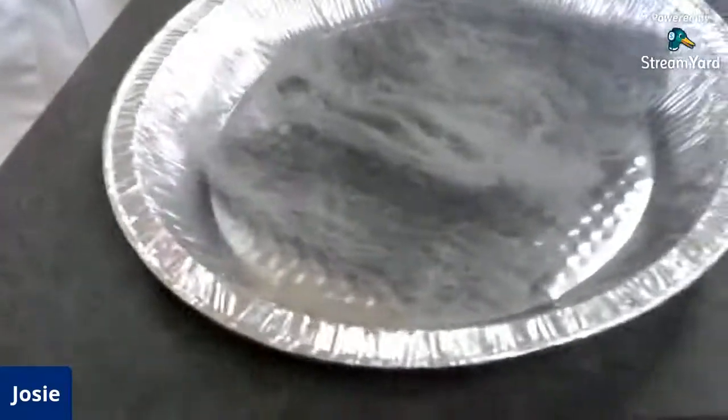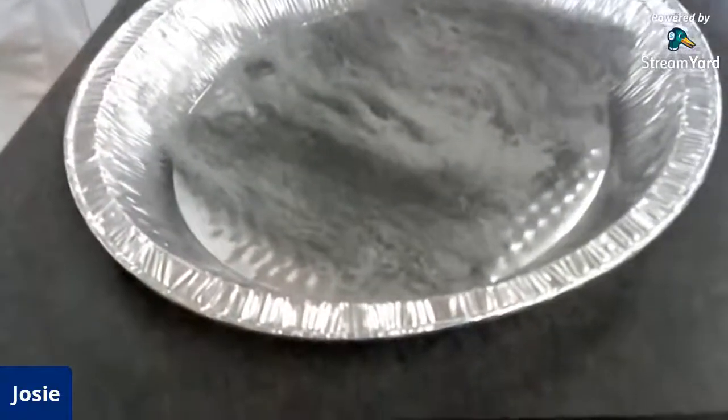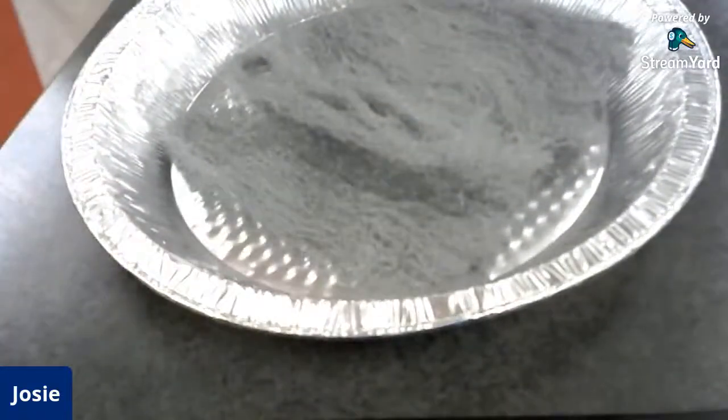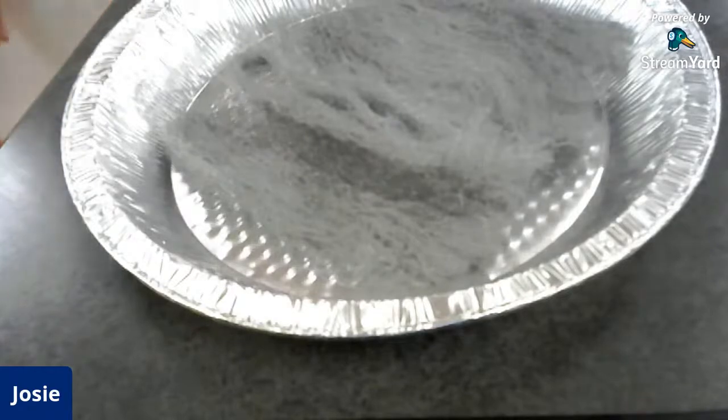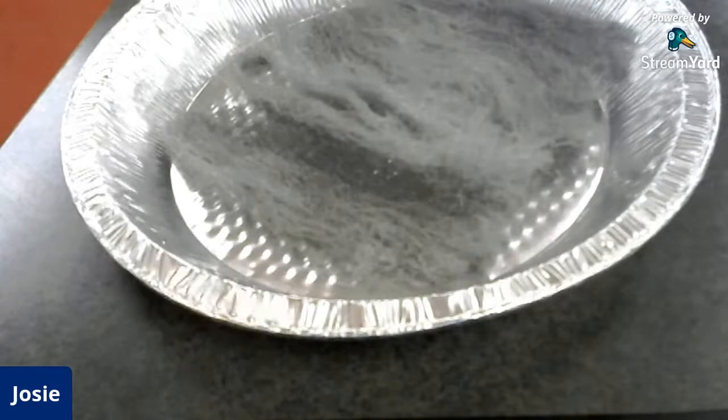Try to get a good angle so you can see really well. Okay, so this is steel wool. This is super fine steel wool, so when handling it, you need to use gloves. And I'm going to take a 9-volt battery and show you how to light it.